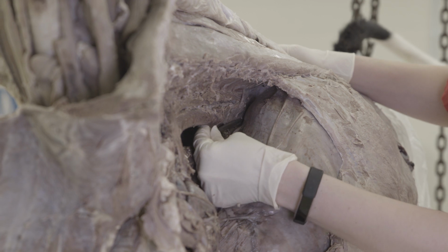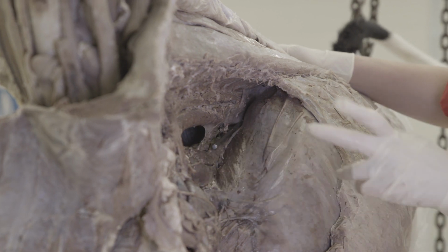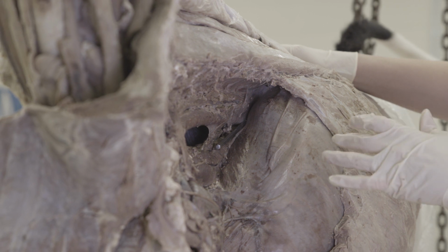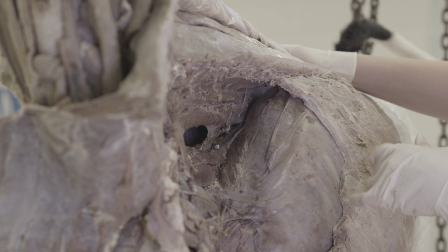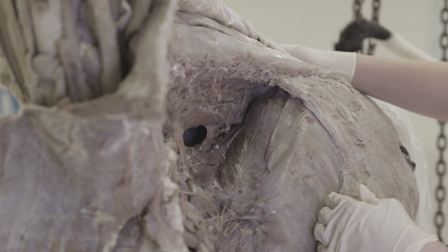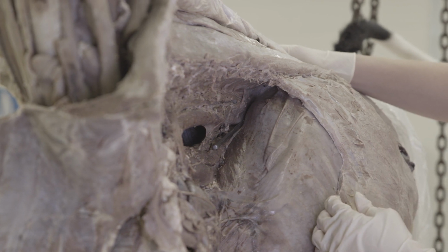So I'm just going to put the probe in there, so hopefully you can see where that probe is going. It's really far in there, so hopefully you can see a little bit. But that's the aortic hiatus, where the aorta travels through the diaphragm. And now we'll go ahead and take a look at the right side of the calf.